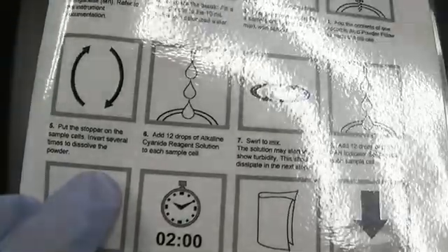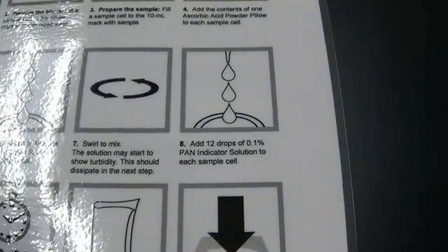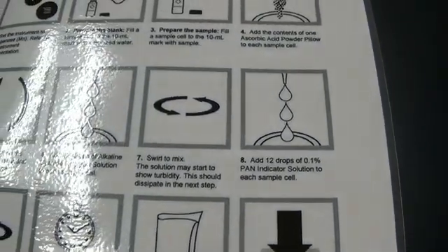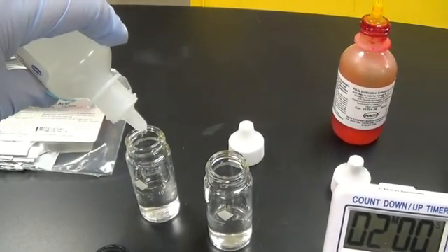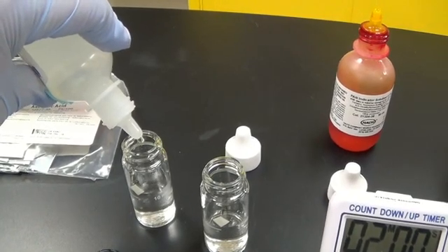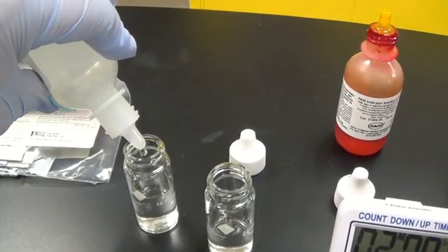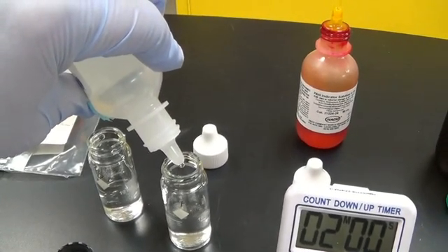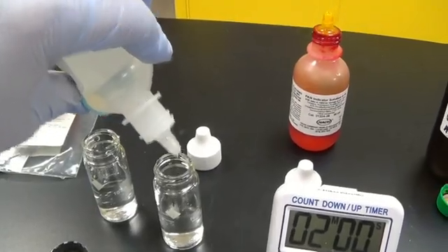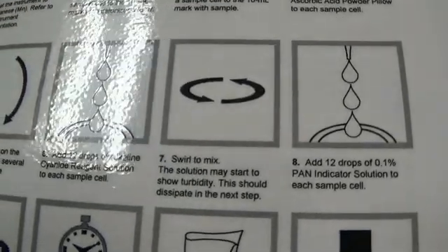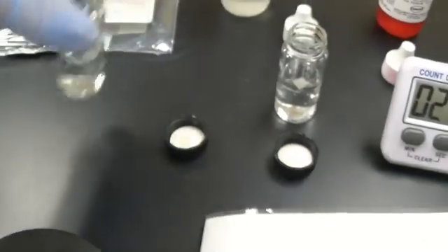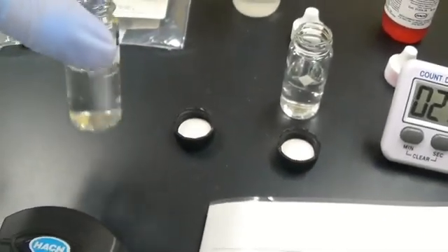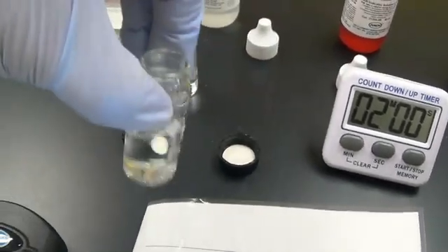I put on the stopper and swirl to mix. Then I add 12 drops of the alkaline cyanide reagent solution to each well. You don't have to put on the cap, just swirl it. Here's my blank and here's my test.